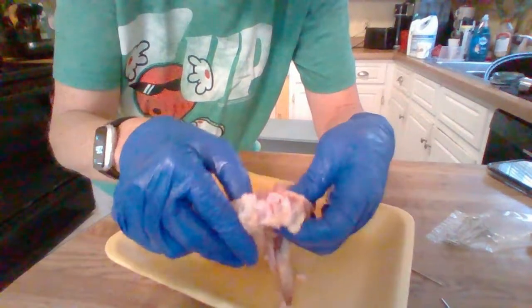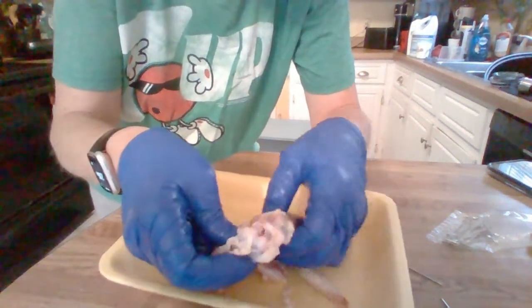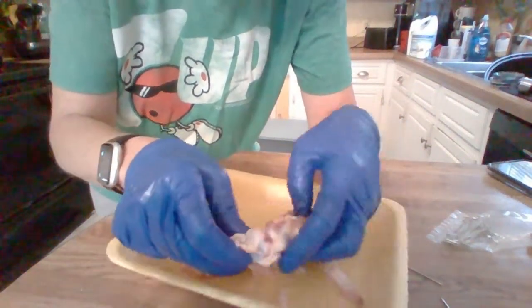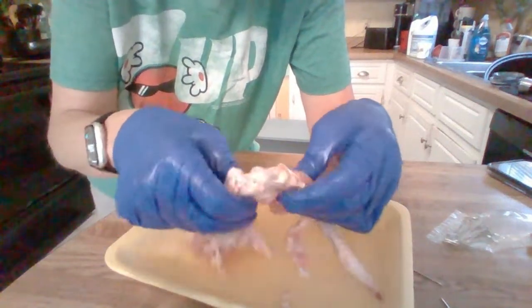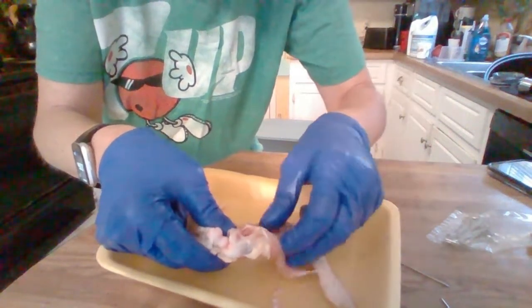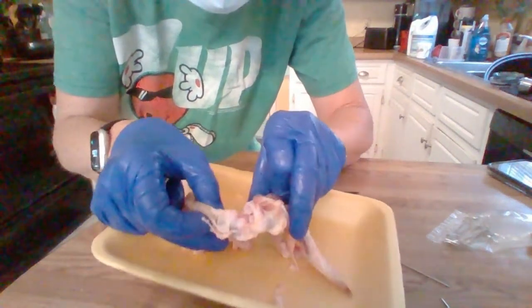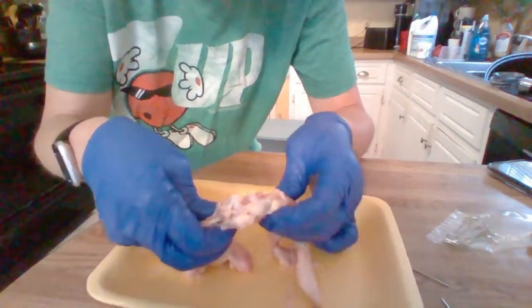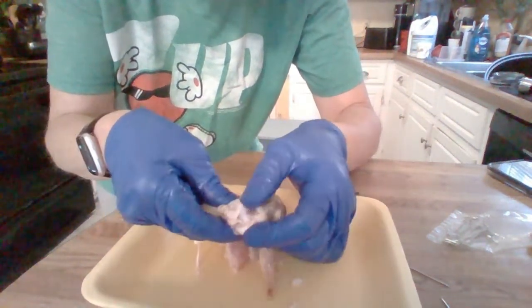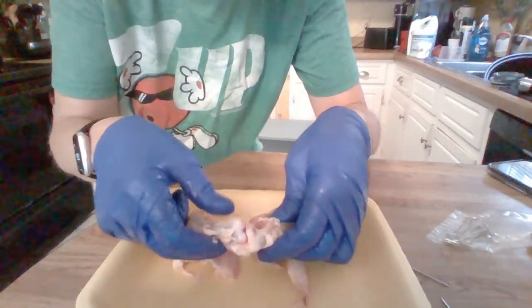So in this chicken wing, we have the bones that make up the joint. Here we have the humerus right here, and it goes into the over here. The radius and the ulna make up these joints here. This is the synovial joint, and then right here we have the articular cartilage. It helps protect the surface of the bones here as that joint goes in.